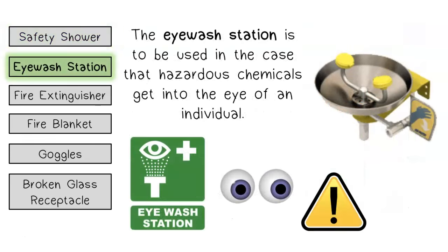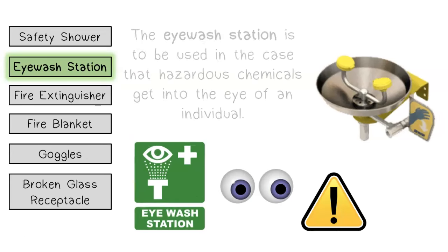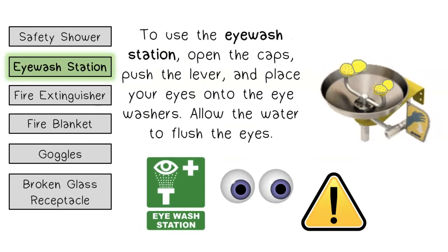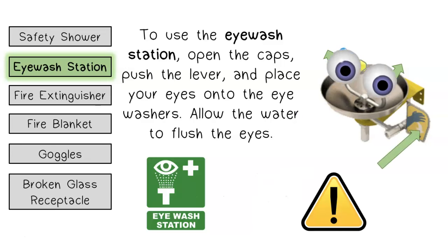The eyewash station is to be used in the case that hazardous chemicals get into the eye of an individual. To use the eyewash station, open the caps, push the lever, and place your eyes onto the eyewashers. Allow the water to flush the eyes.